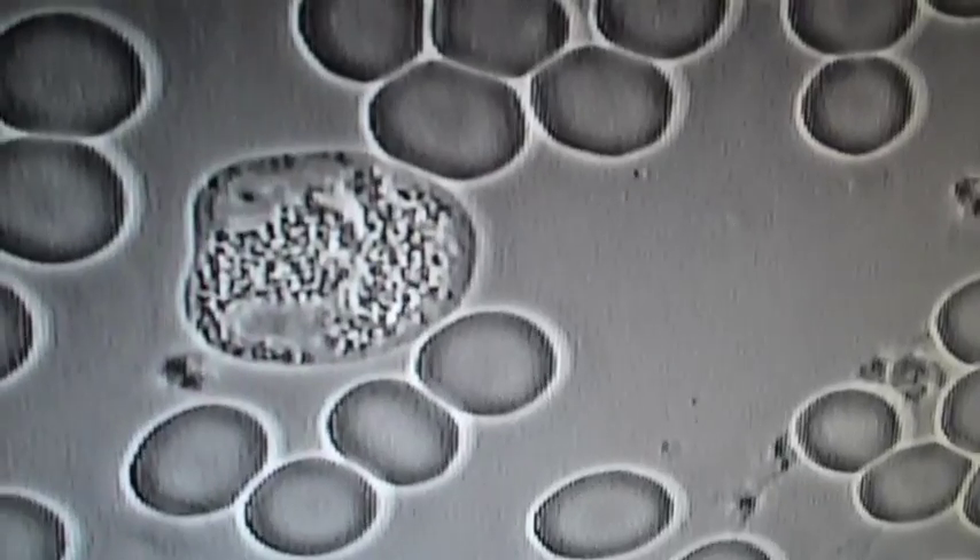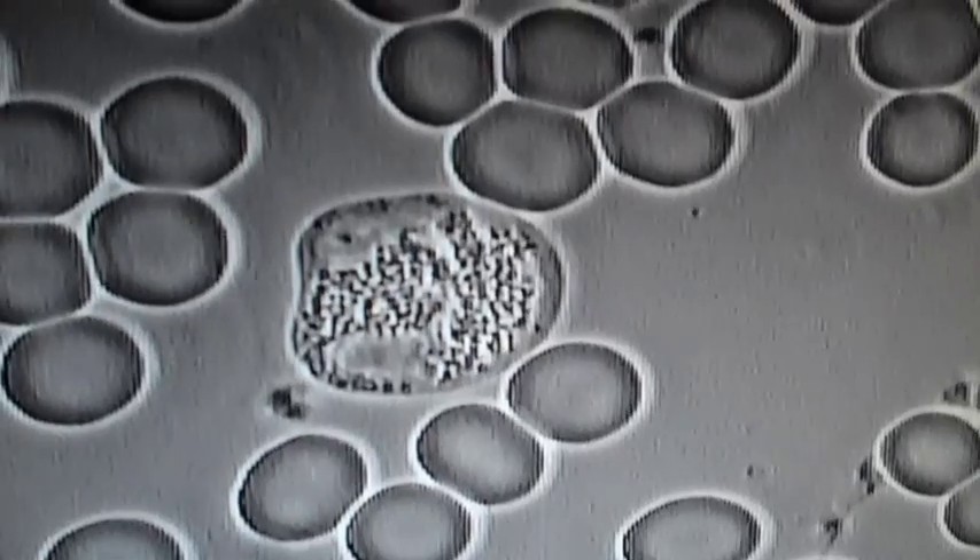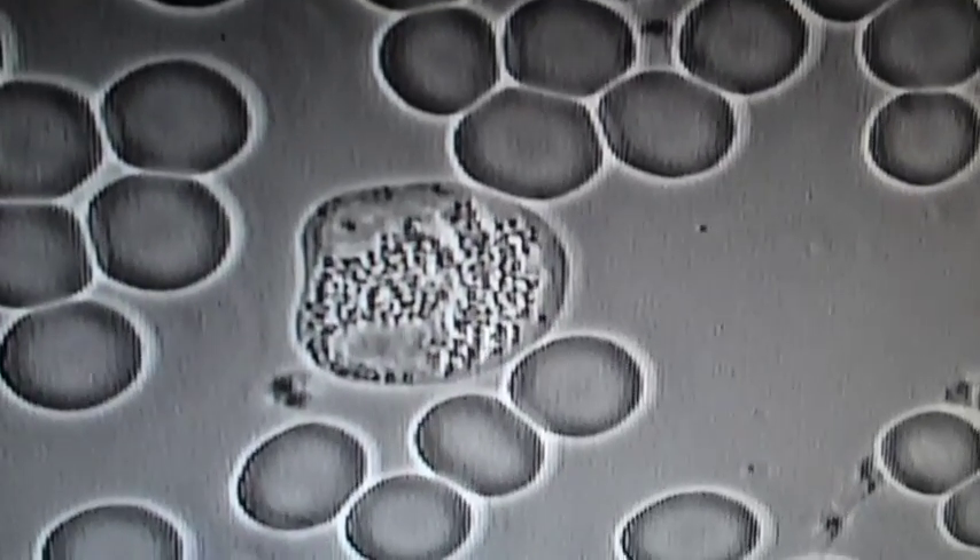She still has inactive white blood cells, but a lot less bacteria. Before, the blood was absolutely teeming with bacteria.